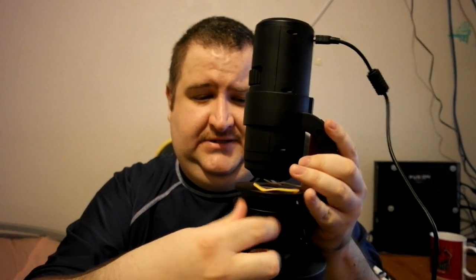The actual unit itself is plastic, but it's still good for its design. It's not perfect, but at the same time it's not crappy either. I don't think it's crappy anyway. I think it's got a very similar camera to the one that I've got up there. The camera might be a little better on the light, I don't know, but anyway. My point is, it's got a focus knob, which was annoying me, to be honest, just trying to get focus on the other one. So I've got the focus knob, I'm able to focus on anything, and I've got some software. I did have initial teething problems with the software with this too. It's actually not compatible with Windows 8. But I got some software that actually works with it, and I'm able to take photos and images of stuff at good resolutions.